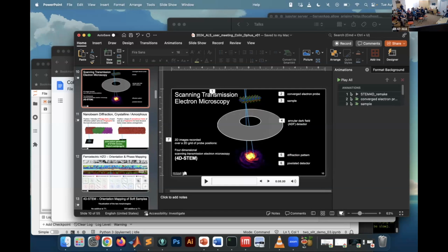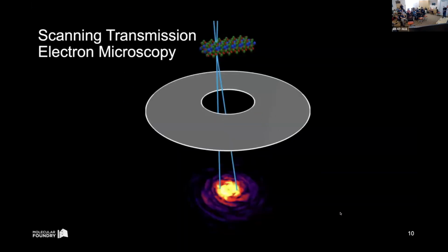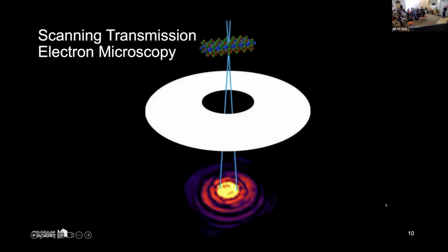Okay, so this is just a quick configuration. Okay, there we go. Just sort of showing this scanning diffraction operating mode here.